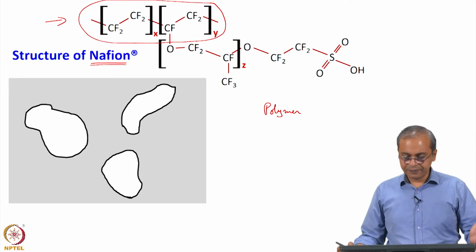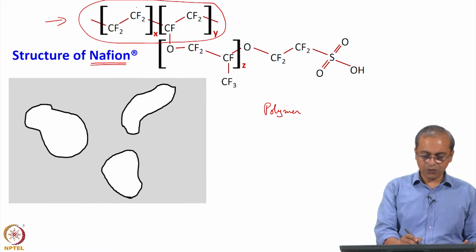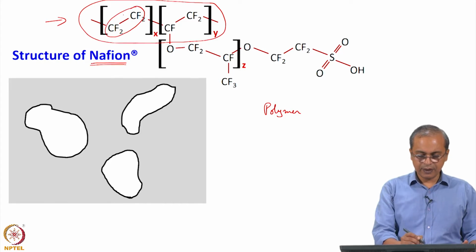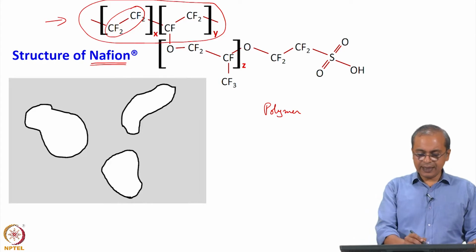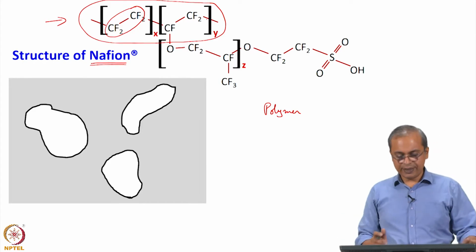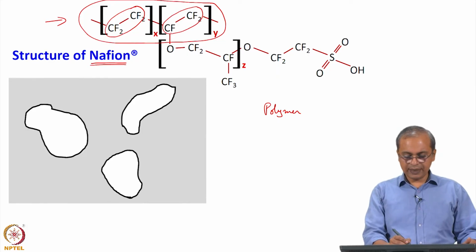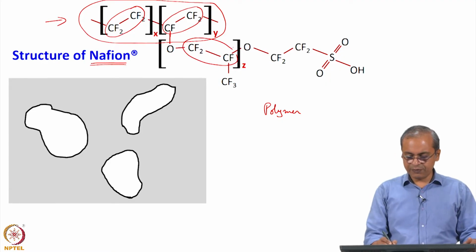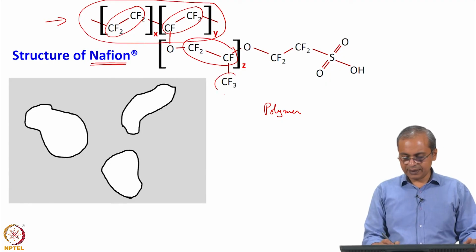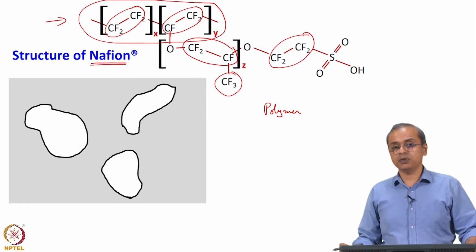So, the way this works is you can see here the CF2 group, that is the tetrafluoroethylene, and that is the primary unit that you see at various locations in this. So, you see some variation of it, one more fluorine has been removed and that is how you got this side chain that is showing up here, and here also you see the CF2CF with one CF3 that is present here, you see the CF2CF2 here. So, you see considerable presence of this CF2CF2 group.